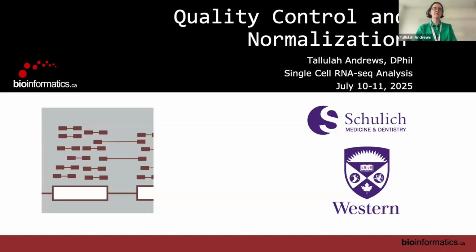The next lecture is going to be on quality control and normalization. So you noticed I've been talking about log normalized counts and scaled counts. Now we're going to talk about where that comes from. Why do we do log normalized? What does log normalized counts even mean?